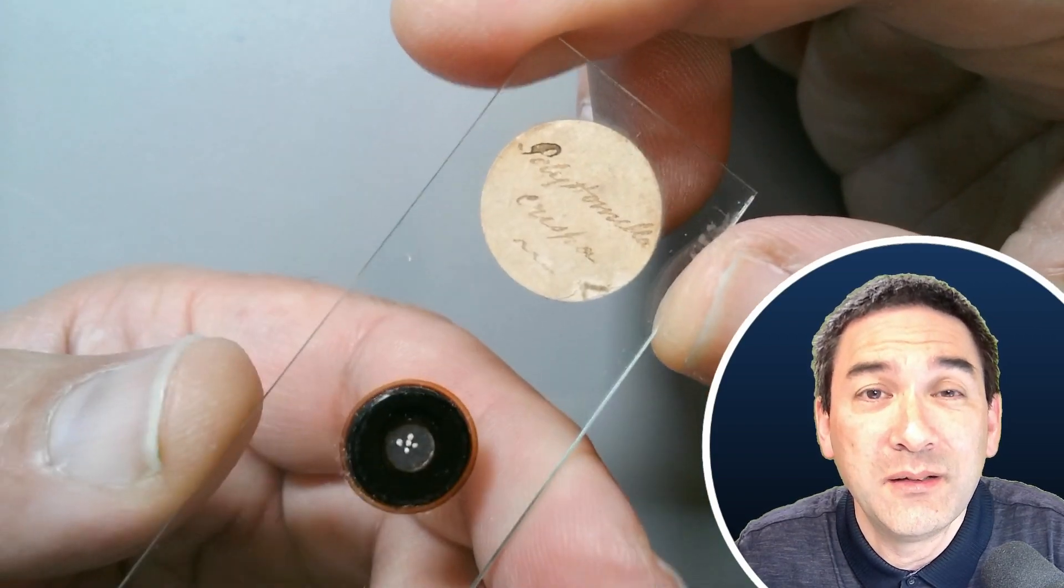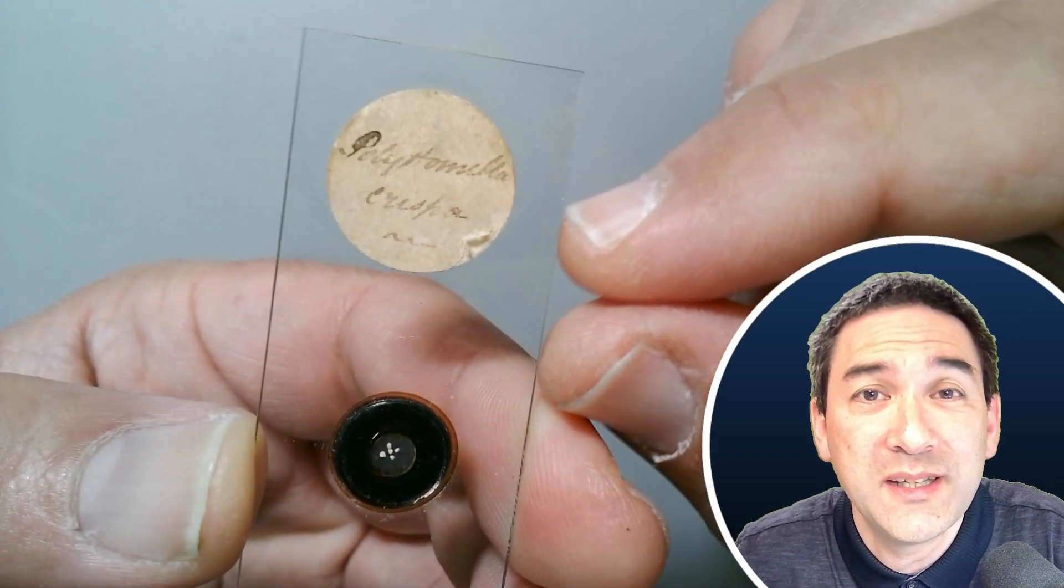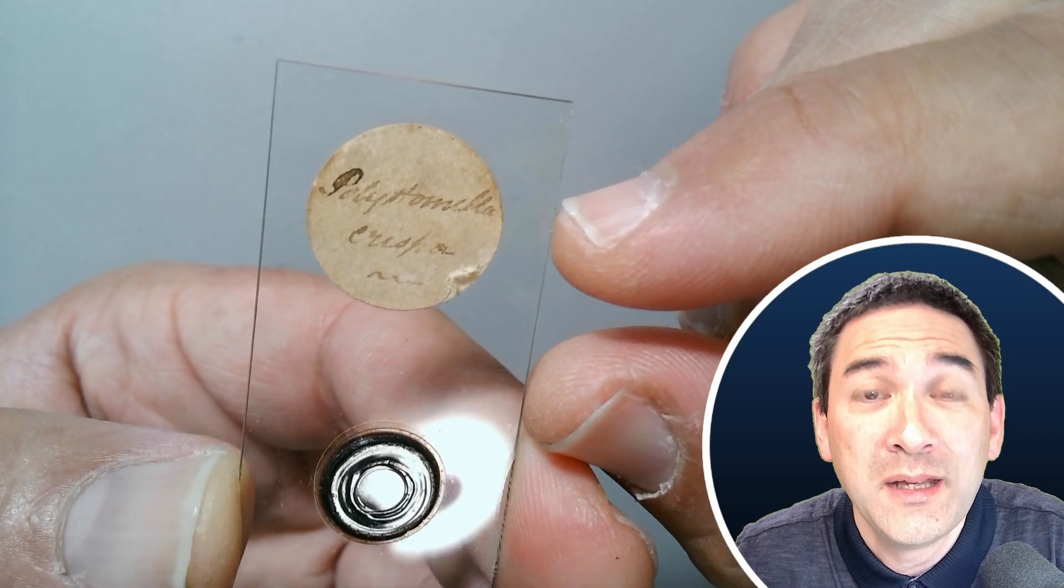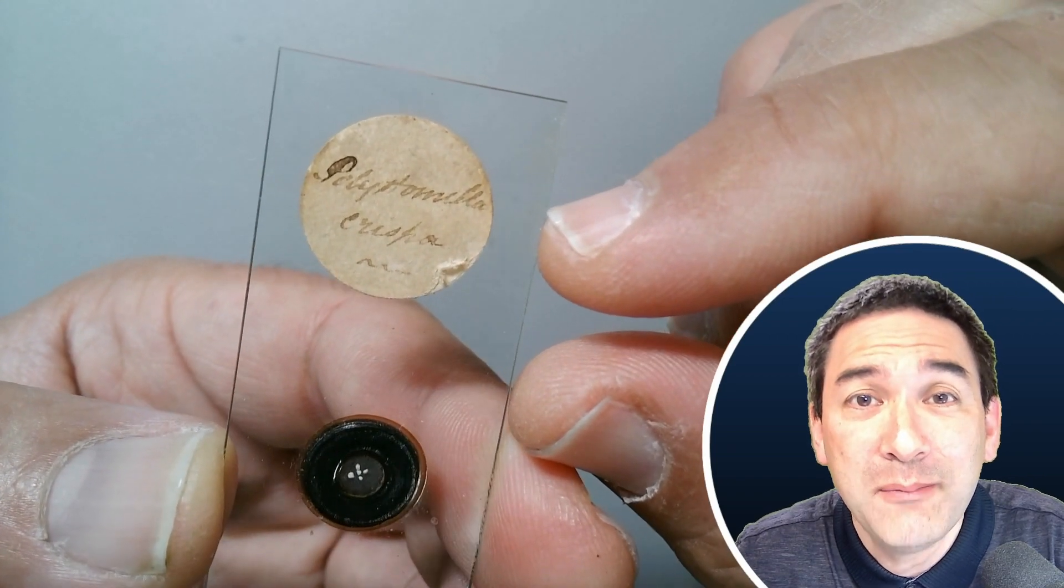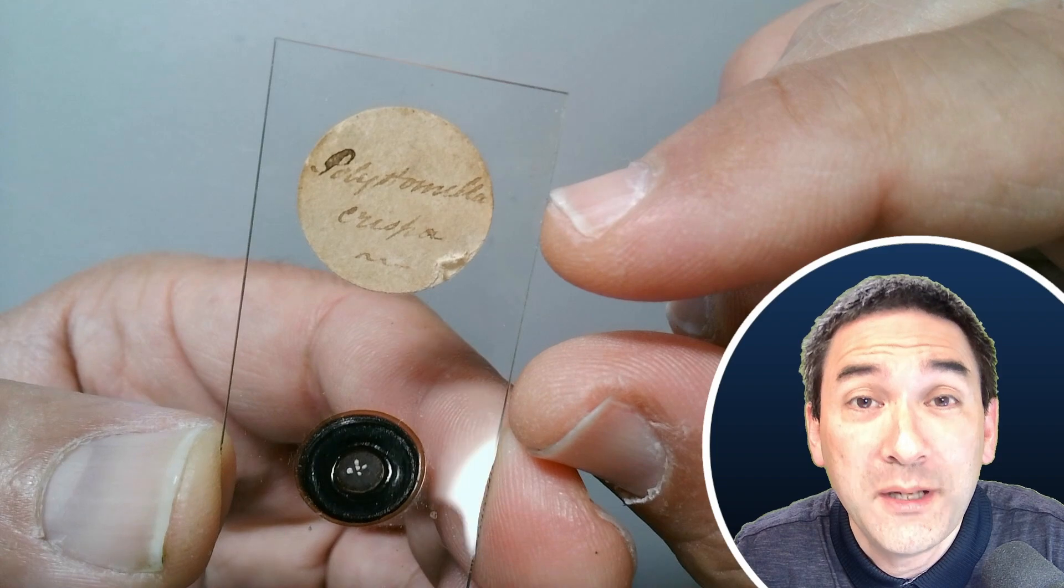The slide label is difficult to read here. It says Polystromella crispa, and indeed that is the name of a certain species of foraminifera.